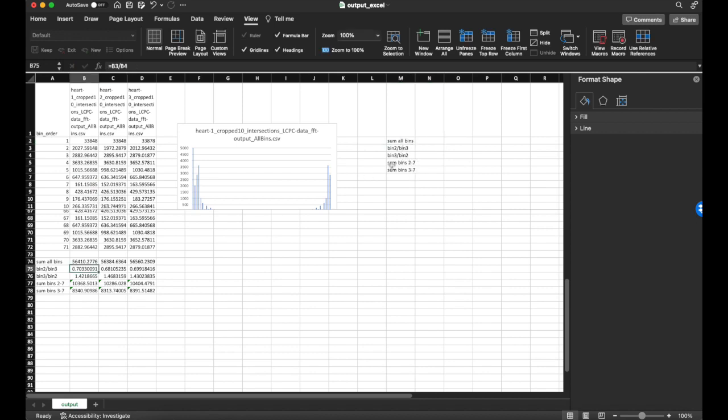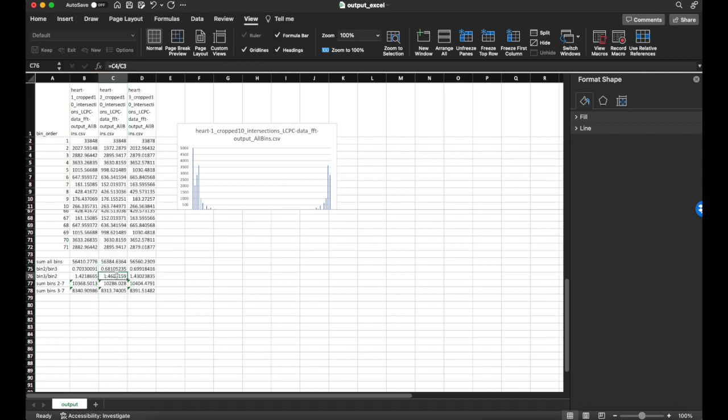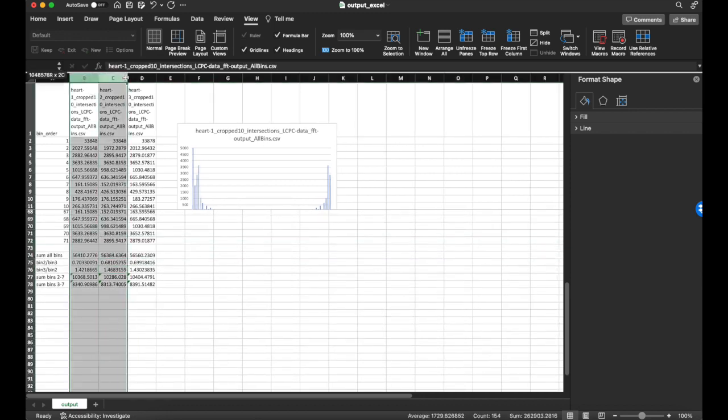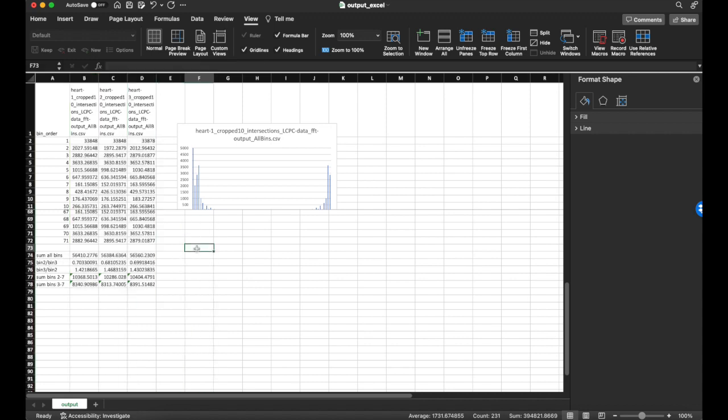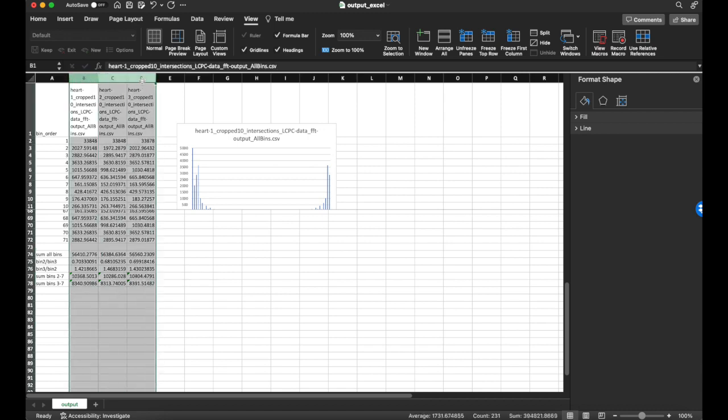I just place it down here because when you have many, many hundreds of samples, say, here we only have 3, it's often useful to sort all these samples from high to low for one of these indices. And so when you put it down here, all your indices underneath, in the last row, then you can sort all your columns from high to low according to one of these rows. It just makes it easier to analyze. So that's how to calculate indices based on the CSV output.